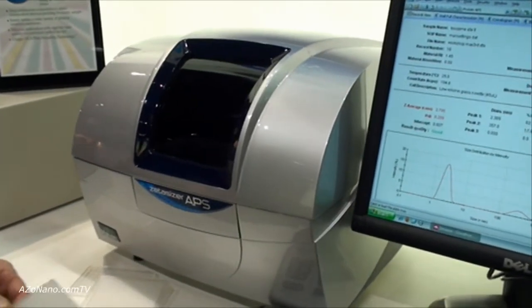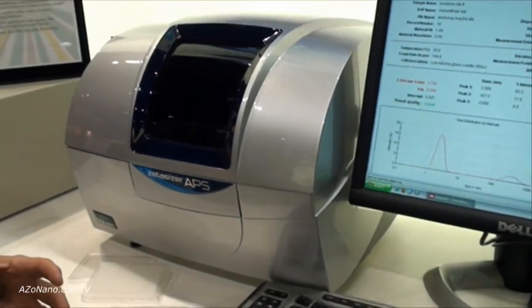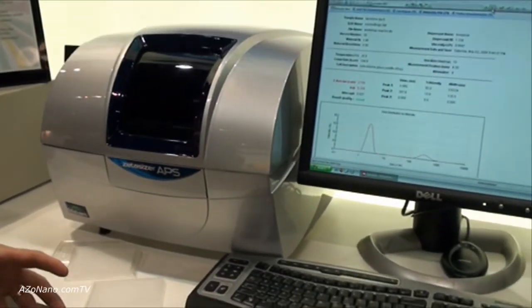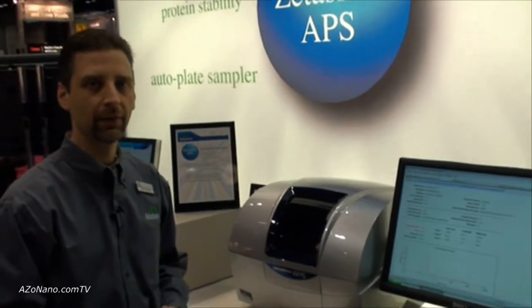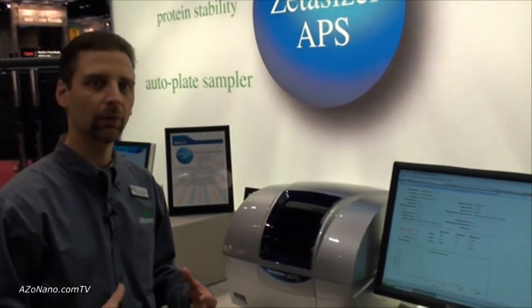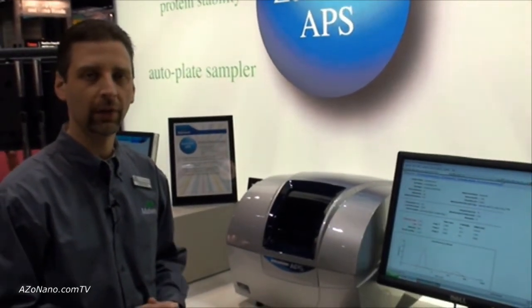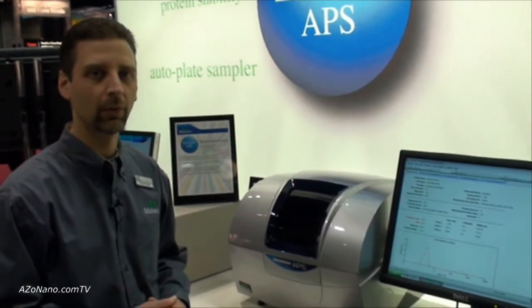After defining just a few measurement parameters for how to measure the samples in the wells, we click start, and the instrument automatically analyzes and characterizes all the samples on the well plate.